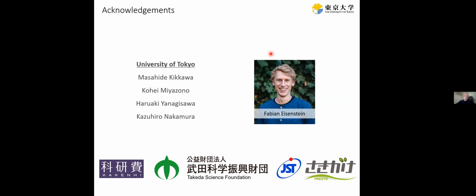What's actually the decision-making factor is looking at the sample. Say the concentration is pretty low, then you don't have, for example, particles in the center of holes. Then it definitely should collect a few images around the edge. And if, on the other hand, there are too many particles or the concentration is too high, I tend to collect 1 image in the center. The throughput overall is a little bit faster with more images. Yeah. Thank you.